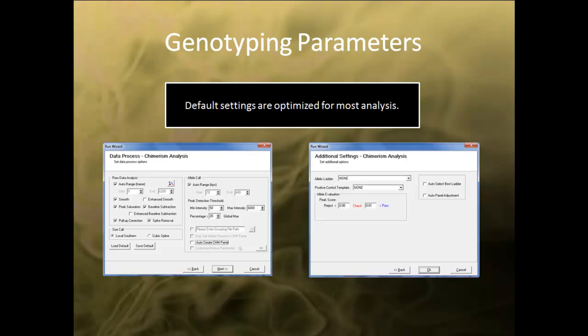In the second and third page of the Run Wizard, the default settings selected are optimized for most analysis. For more information on each settings, please refer to the ChimerMarker introductory webinar for clarification. Otherwise, leave the settings at default and continue.